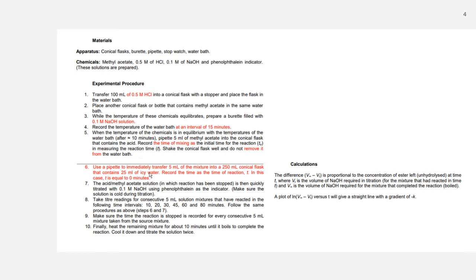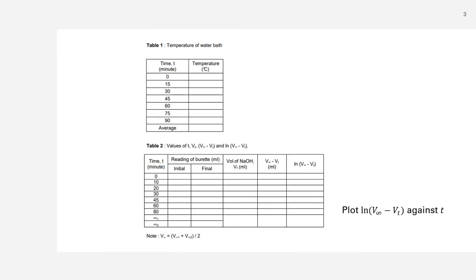It's not really icy water, you want the ice, because icy water is not cold enough, and you want to stop the reactions. But of course there will be some inaccuracy in there. It may not really be stopping because it's not cold enough. So timing is also important, as I also mentioned in the video.